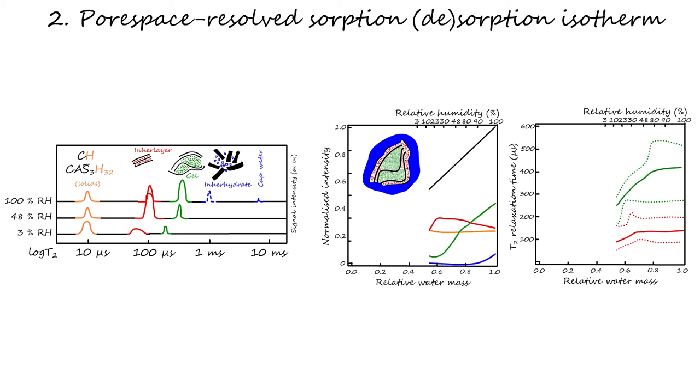Further drying leads to new trends. The gel pore population remains almost constant at the residual level, whilst the relaxation time continues decreasing. The peak boundaries also shift to lower values. The intensity of the interlayer pores decreases now. At the same time, the intensity of the solids increases. The last data point was obtained by oven drying the sample. All pores are empty now, and the solid intensity has reached the value previous to its increase during drying.